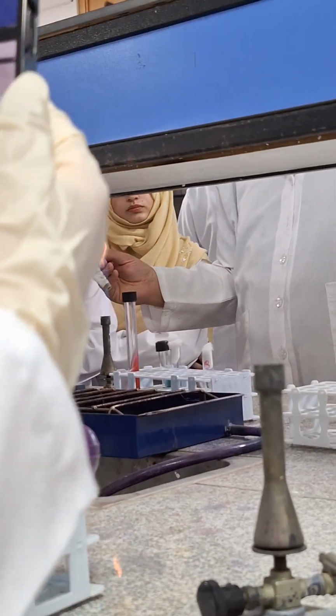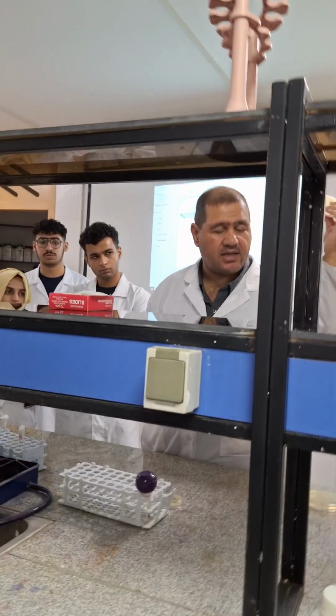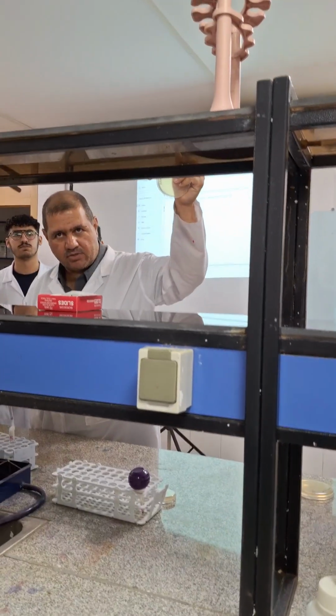Culturing on a plate. There are 3 types of culturing: on a plate, in liquid medium, and on a slant medium.